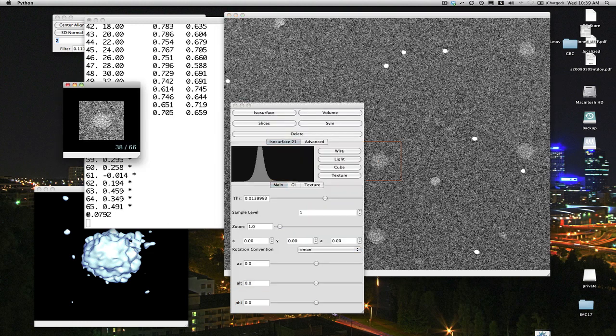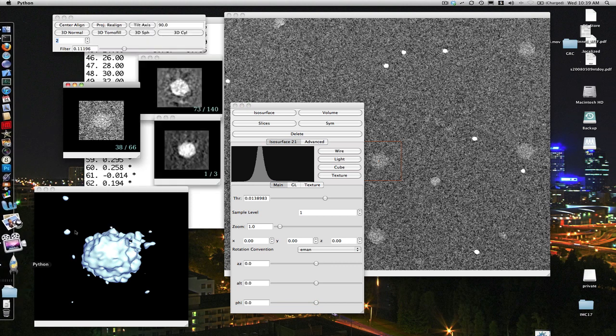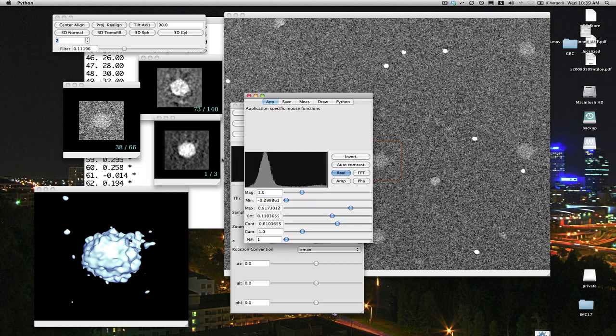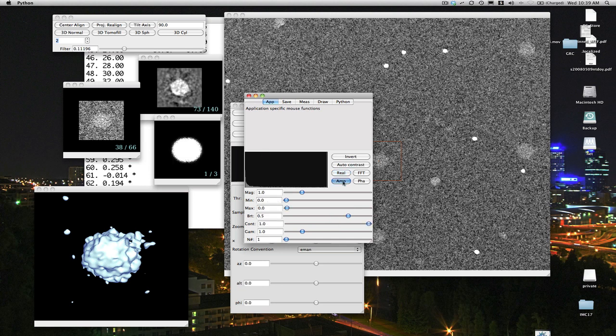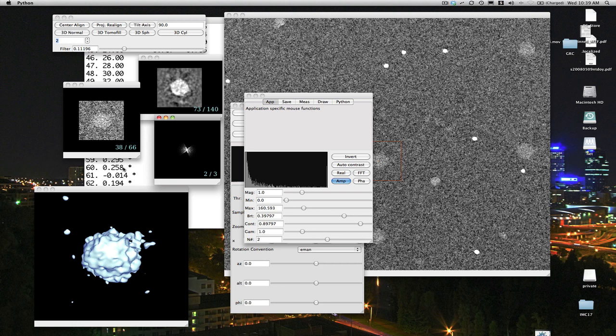Let's see. So if we look at this window and bring up the control panel here, again, we alt-click or middle-click on it, you'll see we can actually display the Fourier transform of the image as well. So I'll say amplitude and auto-contrast here. Now, this is the Fourier transform in the good direction. Here's the Fourier transform in the direction with the missing wedge, and here's the Fourier transform in the very bad direction. And you'll notice the missing wedge isn't quite symmetrical here, and that's because we excluded the last 10 slices from the reconstruction in this particular case.